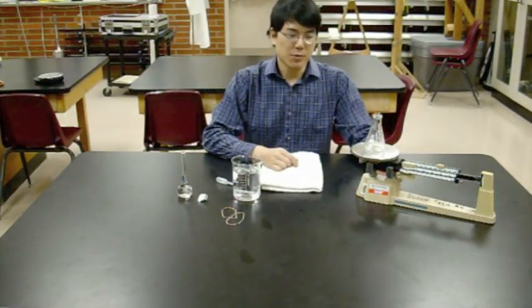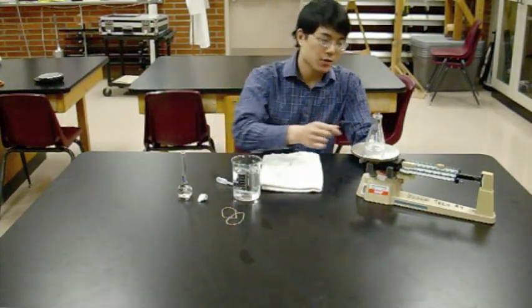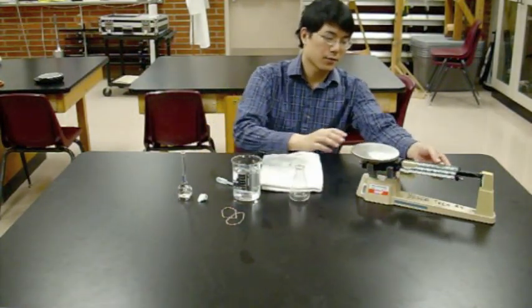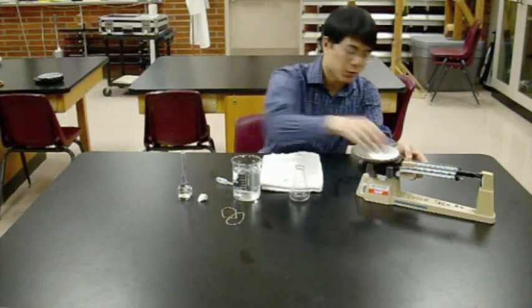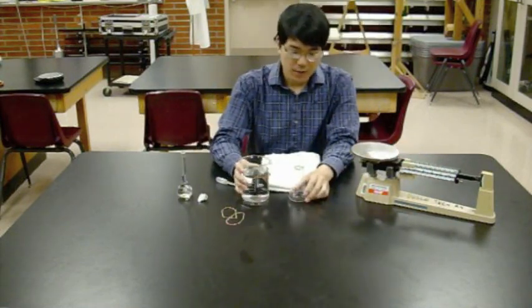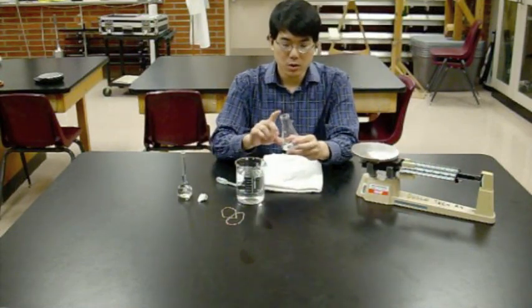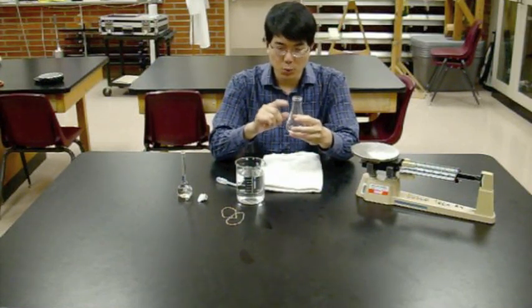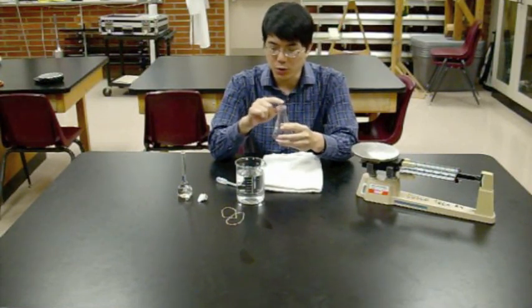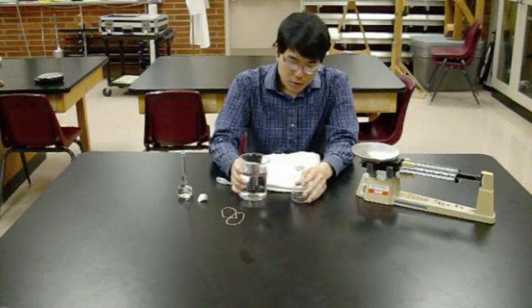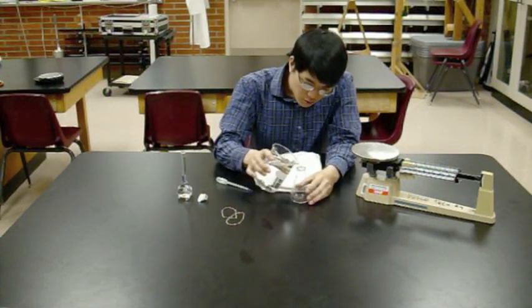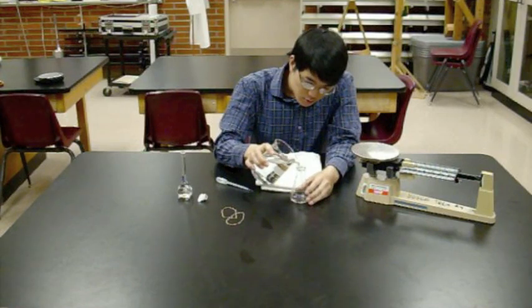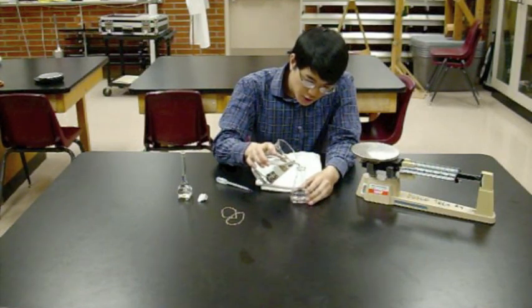So that's a mass of your empty volumetric flask. Take it off. Reset all your sliders. Fill it to the brim with water. You want to get the mass of as much water as this thing can hold. Fill this thing all the way up with tap water.